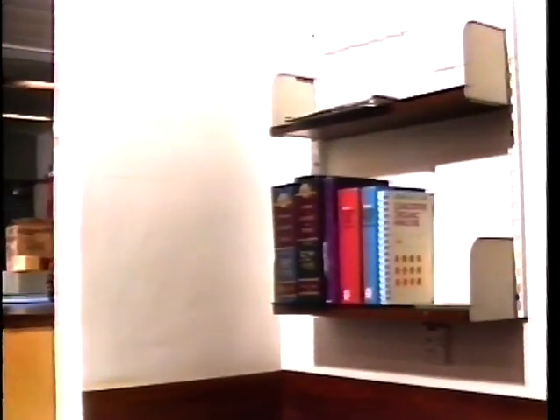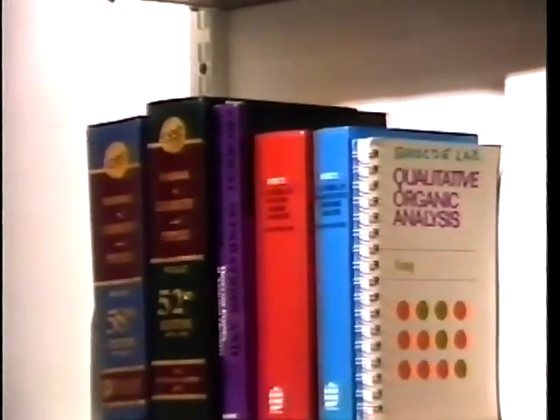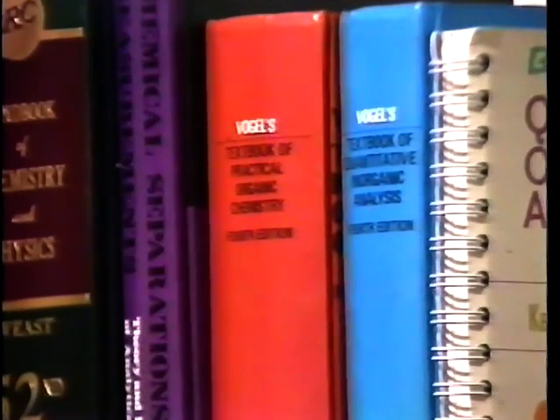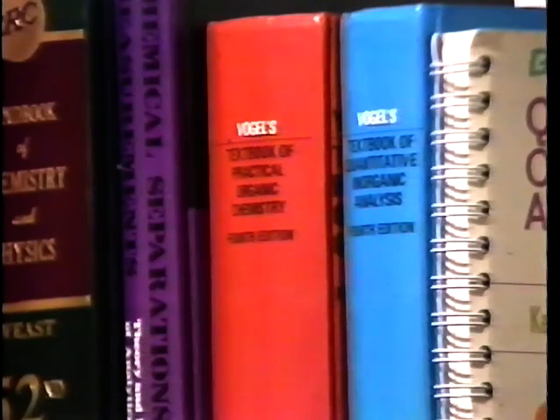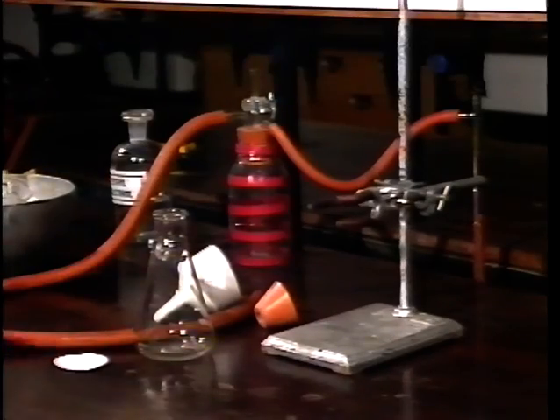If any difficulties are encountered at any stage of recrystallization, consult a demonstrator, or read page 111 of Vogel's Textbook of Practical Organic Chemistry, which is located on the bench next to the demonstrator's desk.